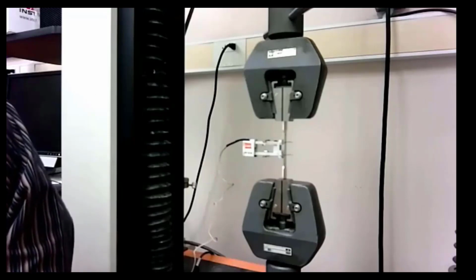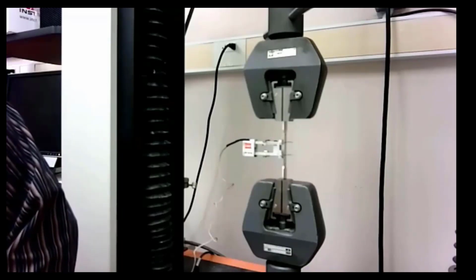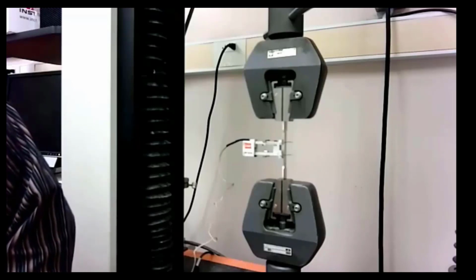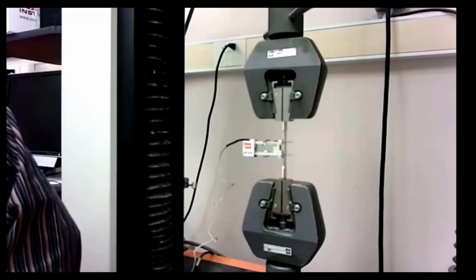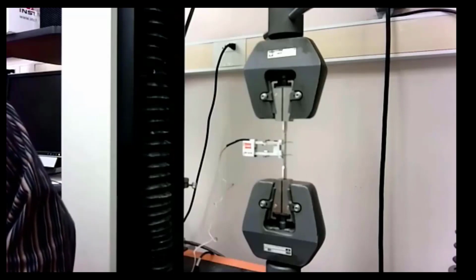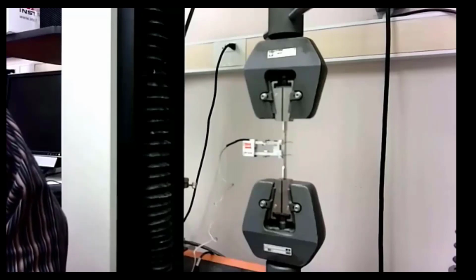Now, once we begin the test, we need to measure strain accurately in the elastic linear region of the stress strain curve in order to get an accurate measure of a modulus of elasticity. But we don't want the extensometer to still be attached when the specimen breaks. So once we get past the yield point, accurate measurement of strain is not as important. And so we can remove the extensometer at that point.